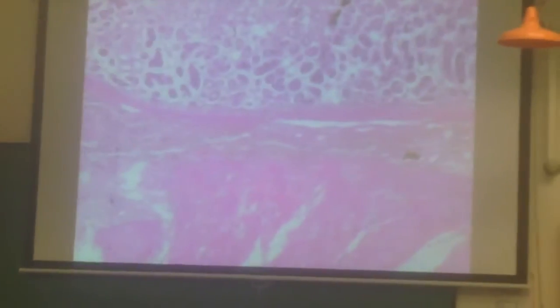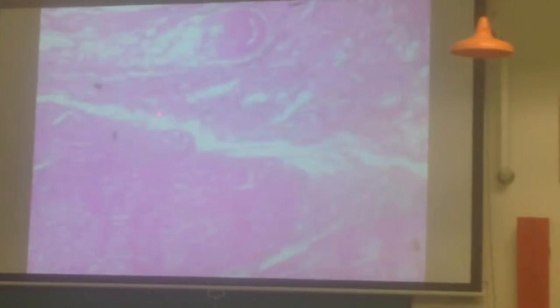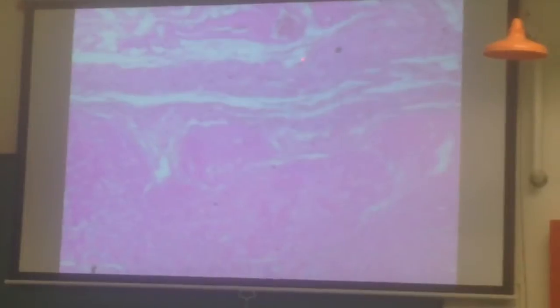I wish I could zoom out just a little bit more, but I can't. It would make a little more sense. So that's the muscularis mucosa. Then deep to the muscularis mucosa is what? What's all this? Submucosa, right? All that connective tissue right deep to it there. And I'm going to try to find a good example of oblique muscle here somewhere that I found earlier.